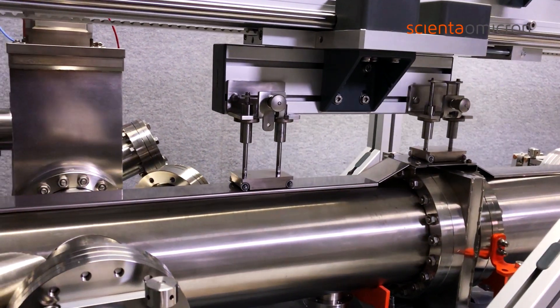Samples, and even the whole trolley, are easily exchanged via the load lock segment.